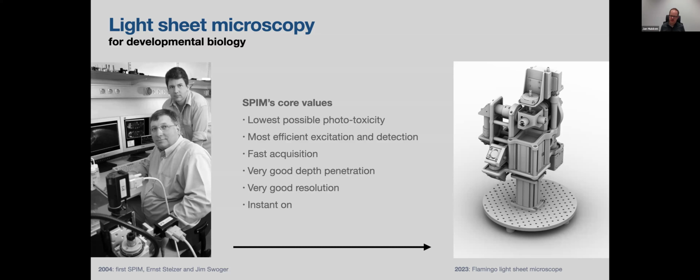Of course, light sheet also gives you very good depth penetration and very good resolution, but these are not the main design criteria. So we are not pushing for the ultimate resolution if that would sacrifice the gentleness of the approach and would create artifacts in the imaging.